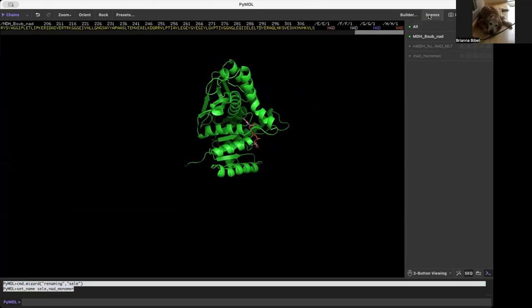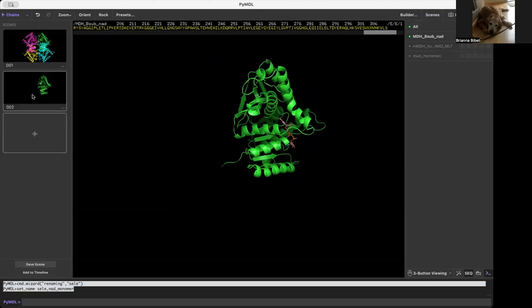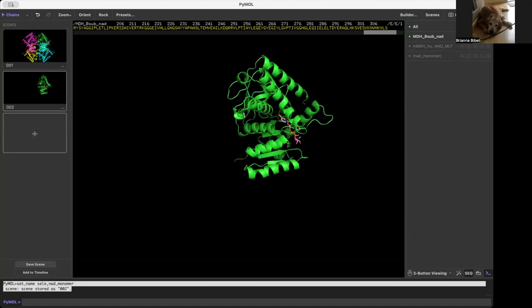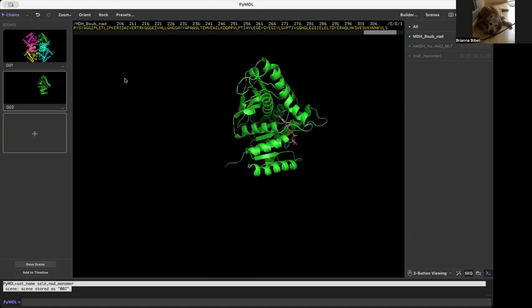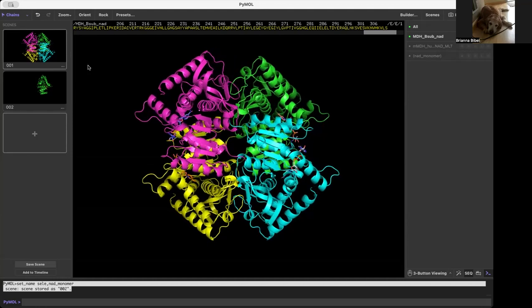I'm also going to save this as a scene, because now what's going to happen is I can come back to it later. Say I want to come over here and view the whole structure again, which I can conveniently do because I've saved that as a scene as well.